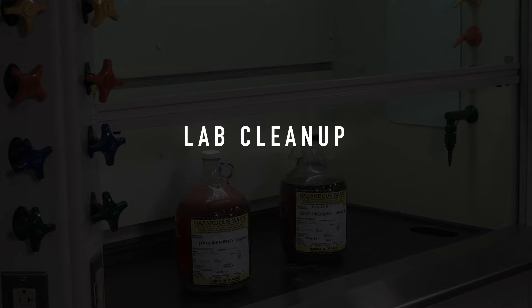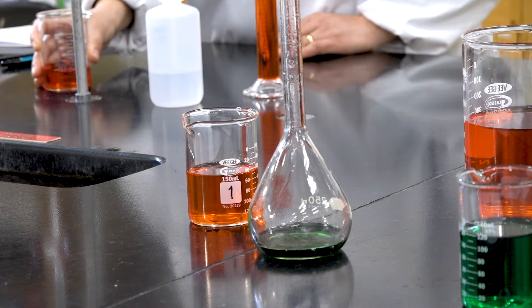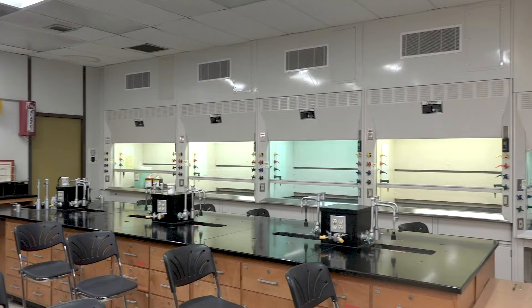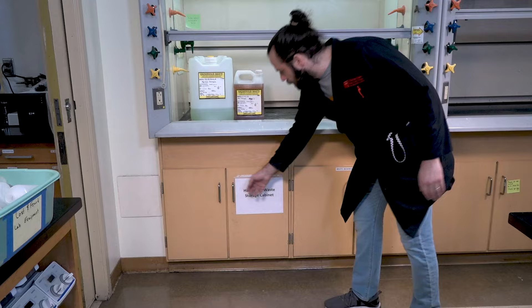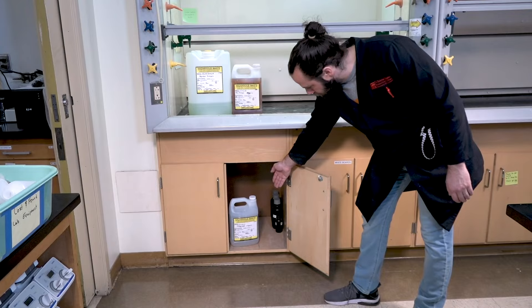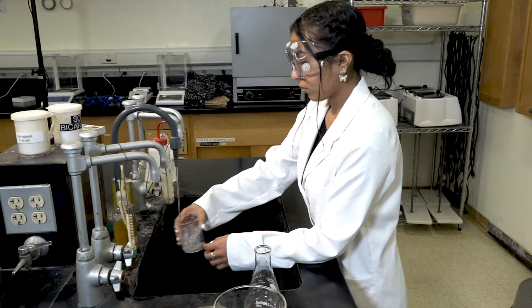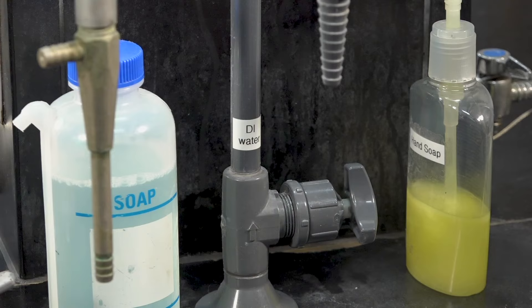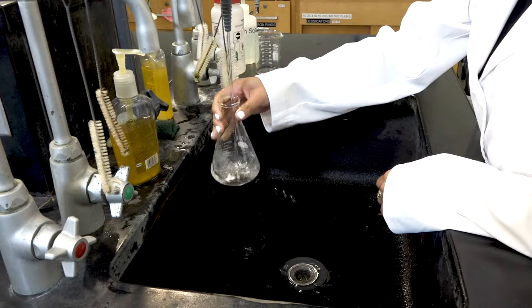At the end of each laboratory experiment, you will need to clean up your station. Start by disposing of all your chemical waste into the proper waste container. Never dispose of anything down the drain unless directed to do so by the instructor. Waste containers are routinely located in the corner fume hood. If you do not see a waste container, ask your instructor. Do not assume that means it is safe to dispose of down the drain. You will then need to wash all glassware you used in the experiment. All glassware must be washed even if it looks clean to the eye. Glassware can be cleaned of most chemical residue simply by rinsing thoroughly with DI water. Fill the glassware with some DI water, swirl, and then dispose of down the drain. Repeat this process three more times to ensure thoroughly clean glassware.